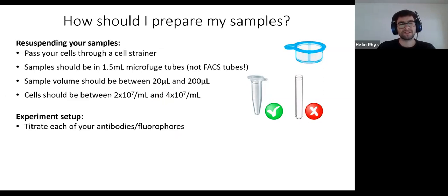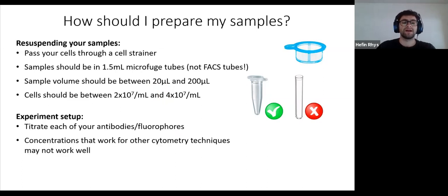So again, important to titrate each of your antibodies and fluorophores when you're setting up your panel, and concentrations that work well for your other panels may not work ideally for the ImageStream. Particularly, we find that viability dyes or DNA binding dyes tend to quite easily saturate the ImageStream.